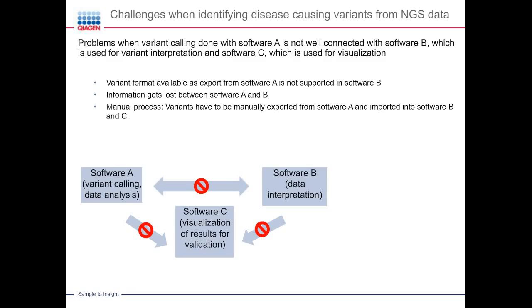The problem is that per se, all these tools are not working really great together as one pipeline. That means you first need someone who builds up the pipeline to automate it, so that when you have many samples, you can run them all together. So that means you first need to hire someone. Then this person also has to maintain it, which is not always the fun part.